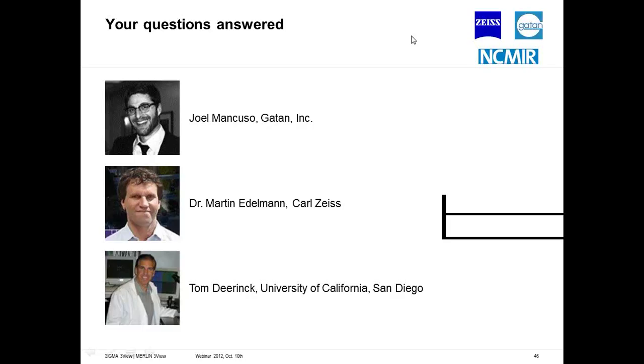So I believe there are many groups working on this. One group in Australia, Richard Webb, he recently got a 3-view system, and he's a big believer in high pressure freezing, and one of the first things he wants to do is get a high pressure freeze, or HPF, protocol that will be compatible with 3-view.